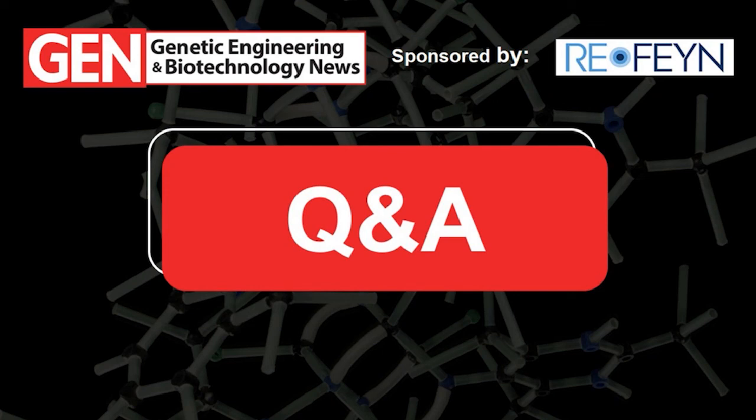Roxana would like to know if there are any limitations on the buffer used for the assays. So far, we have tested a lot of different buffers that are commonly used with AAVs, even those that have had amounts of detergents in the buffer, and we have not seen something that we could not yet measure. But there will always be a first. Sometimes, if you have really highly scattering species in the buffer, it can happen. But so far, we have measured lots of different buffers typically used for AAV, and we did not have any problems with buffers.